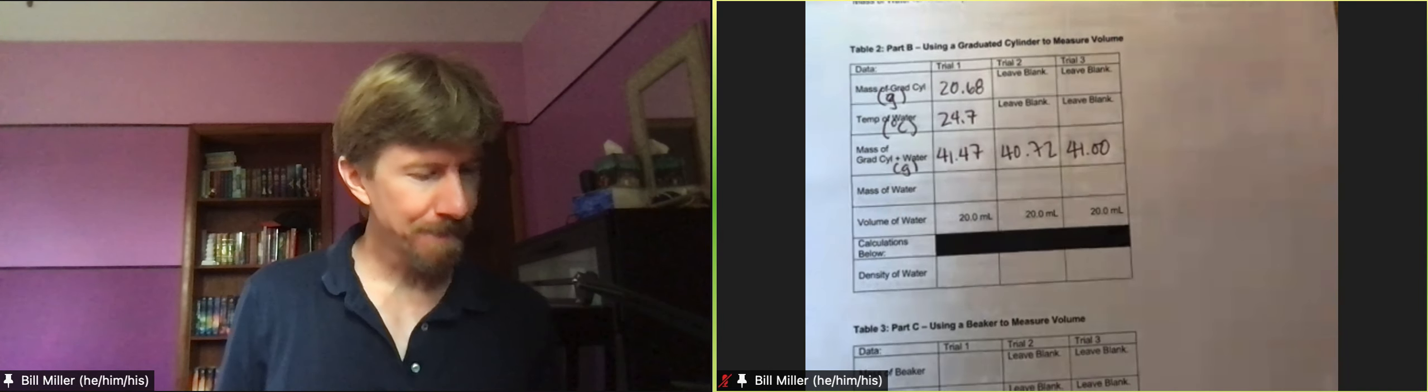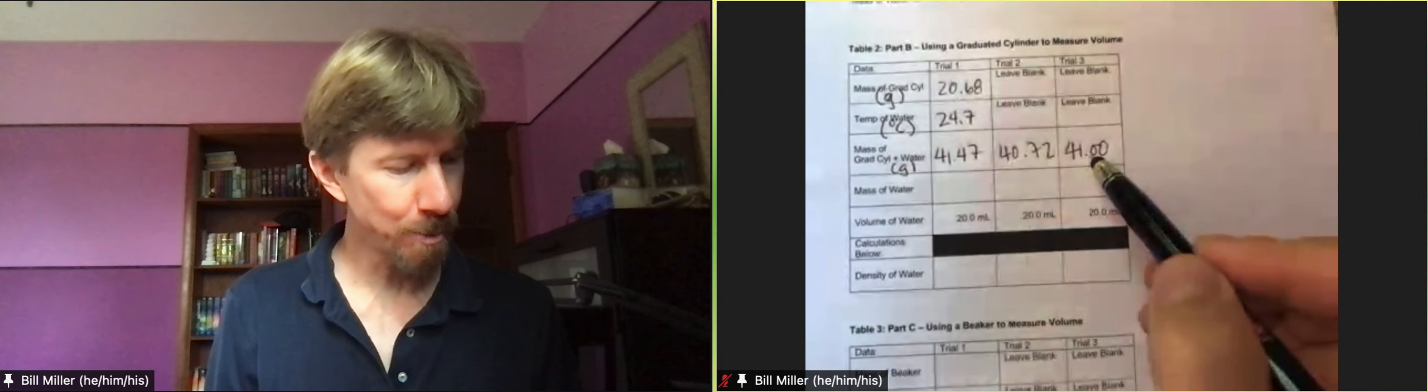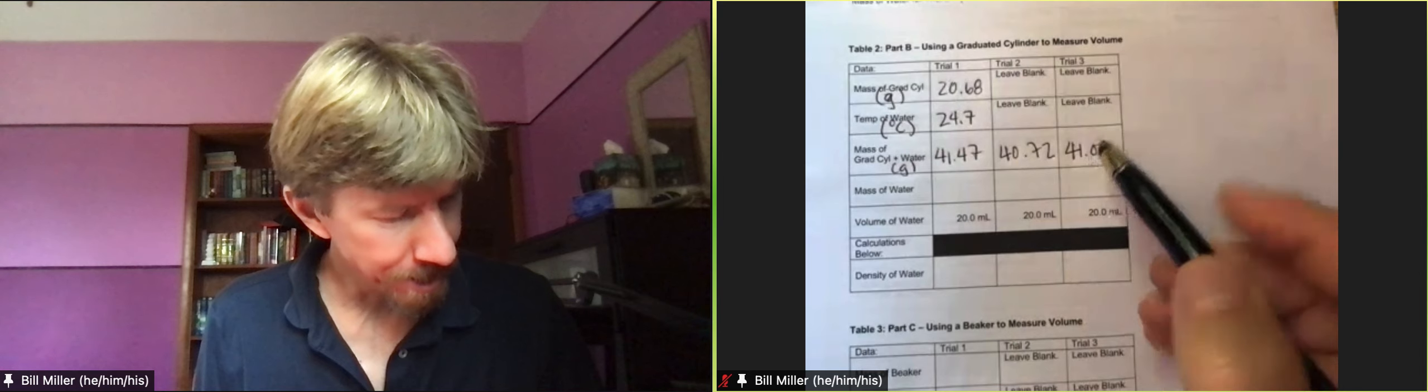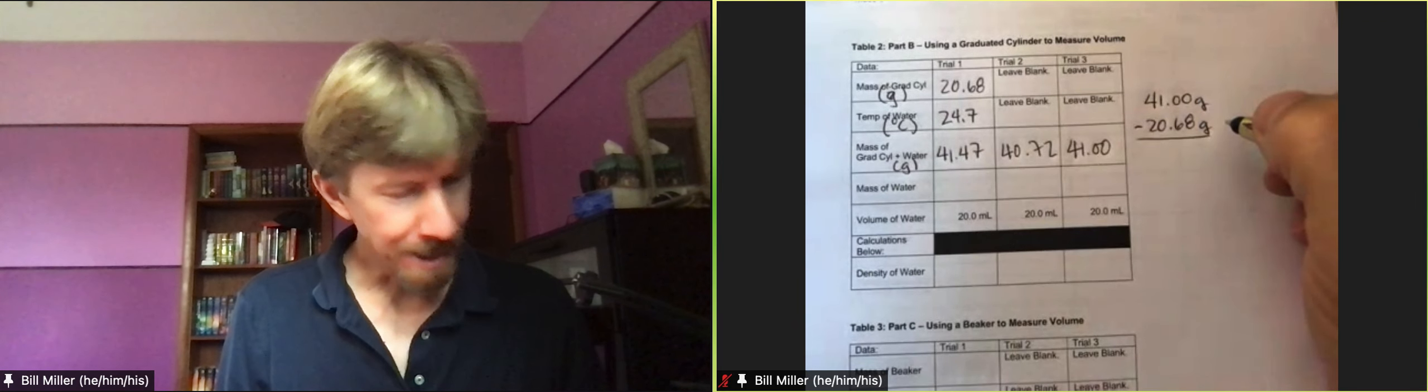That's all we need this time to fill out this table. Let's go ahead and complete table two: mass of water. This time is going to be calculated, and again because we emptied it every single time, we will always be subtracting off just the mass of the graduated cylinder. So I'm actually going to do this one with the 41. It's going to be 41.00 minus 20.68. I love units with numbers, so I'm going to write my grams down there, and I'm still going to do the math on my calculator.